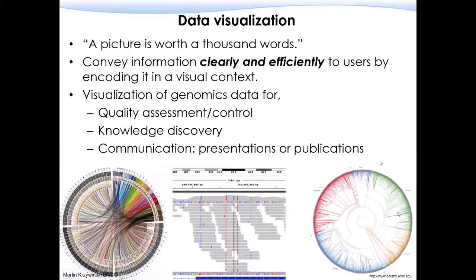So first thing, what is data visualization? Just like the proverb says, a picture is worth a thousand words. Data visualization is to convey very complex ideas through very simple figures. And from the figures, especially for genome data, we can do QC, quality control, or quality assessment.